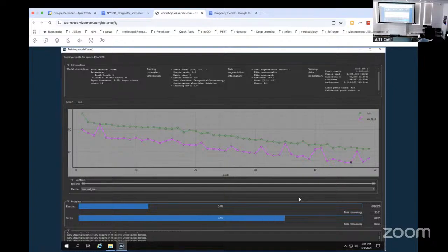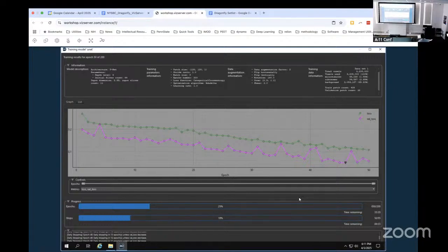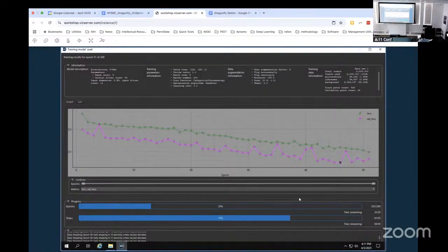We spent about 6 months working on each format. It's like version X, my system was, well, the export, we only export things. So whenever we got the import filter to work, it didn't work the next time. Right, the machine next, they would rotate the data. And the histograms are all off, and you got it to work, it's not perfect, you may like it.